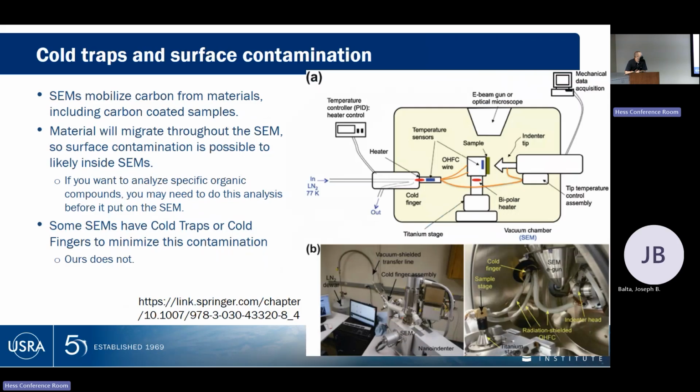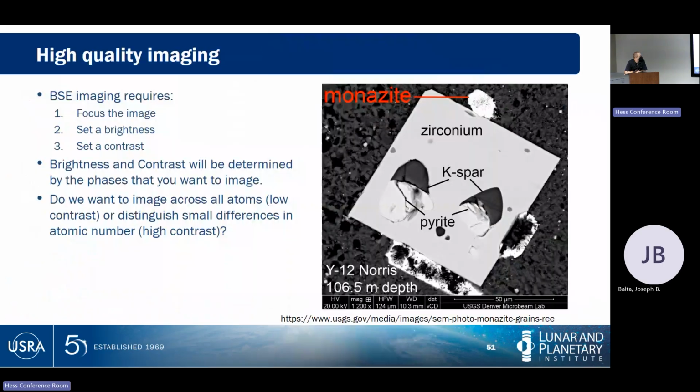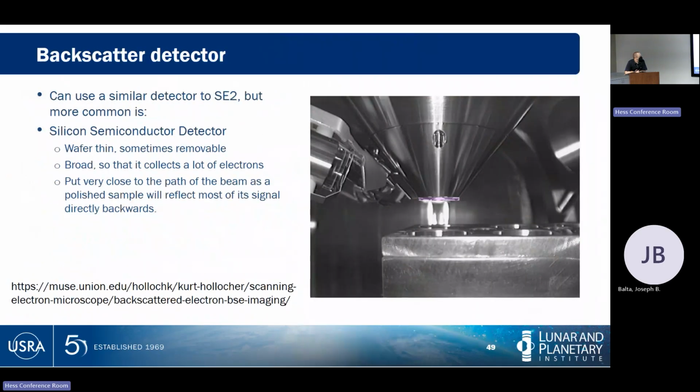There's also another reason for having different working distances, and that's because of the geometry of how detectors are in most columns. For EDS analyses, in order to collect the X-rays, you need to have a large working distance. So if your main interest in putting the sample in is just imaging, you just want to get really good images on a flat sample, you would have a short working distance.